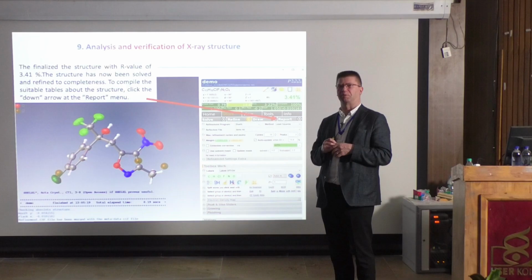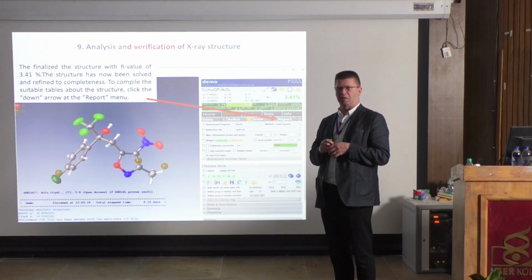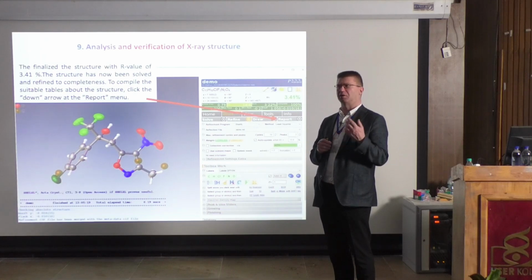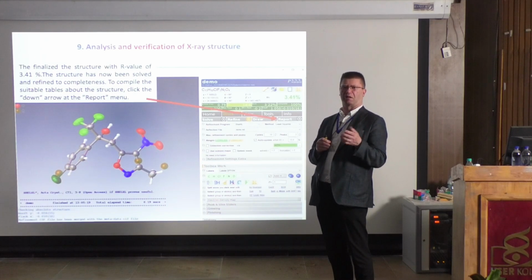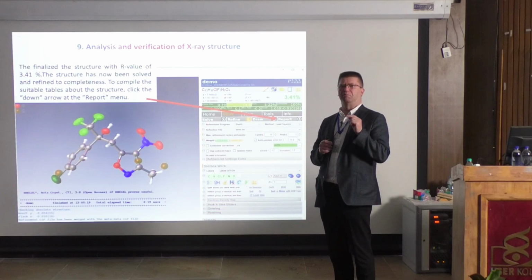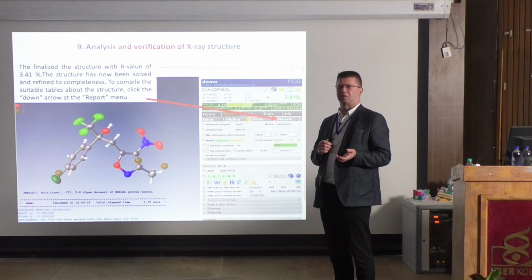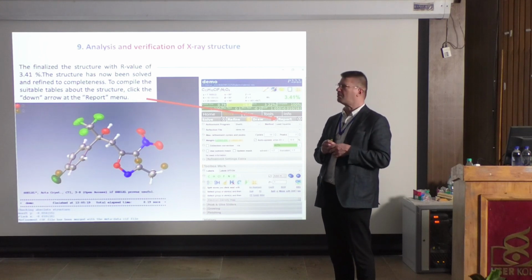These things happen sometimes: X-ray diffraction, as it doesn't know the atom types, can give chemically incorrect answers. Or the computer program, like yesterday when I asked it to calculate hydrogen atoms, in normal cases works perfectly, but sometimes it miscalculates something, so it's up to us to check that that is correct.